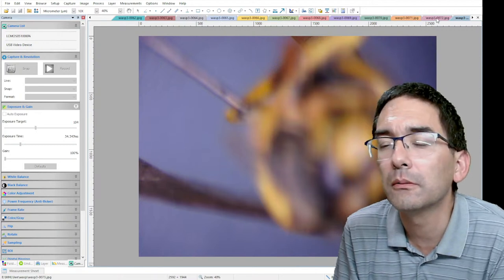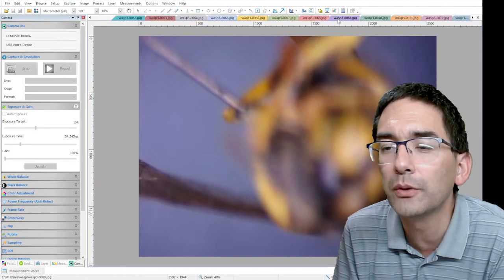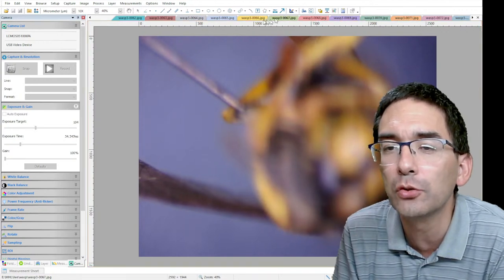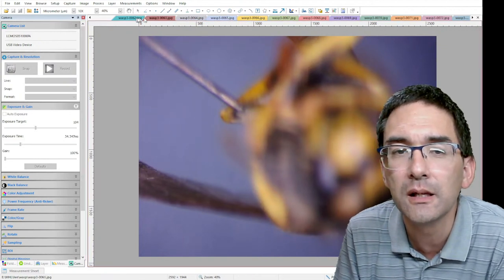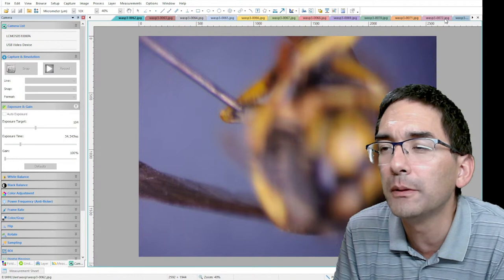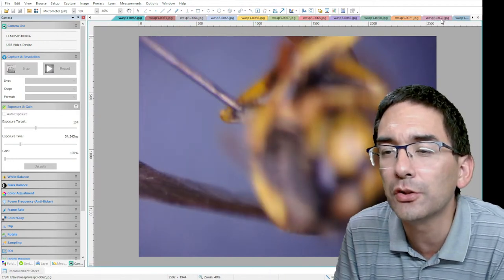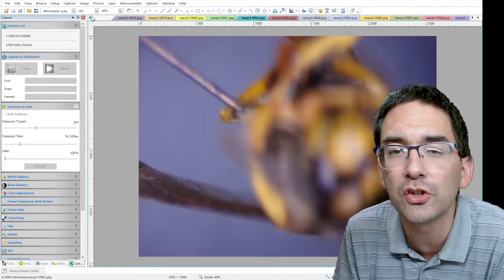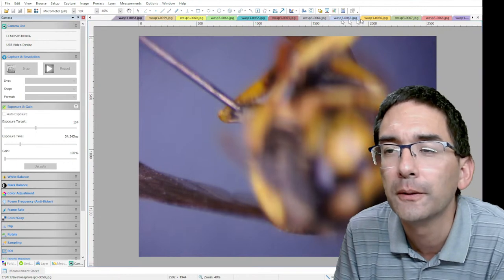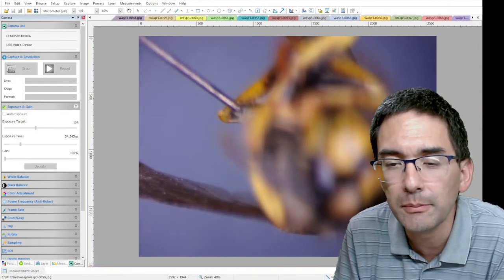Yeah, and look at this here. It's not in focus, but as you click through the different images, different parts start to go in focus. But maybe you'll notice something else. If I click between the first and the last image here, do you actually notice that there is also a horizontal shift? It's not only that the focus changes slightly, but there's also a horizontal shift. Okay, why is that? That's a really important thing. I need to explain this a little bit.